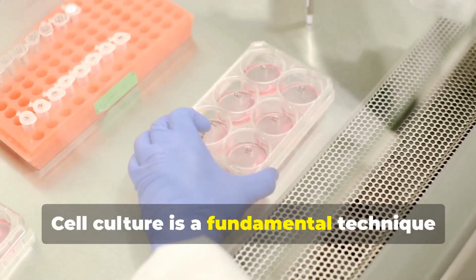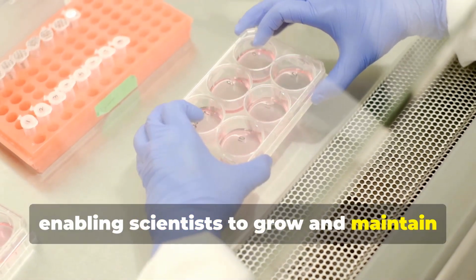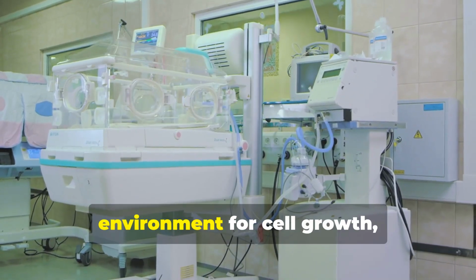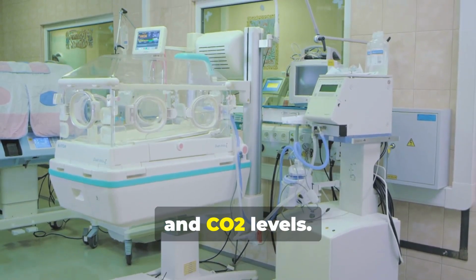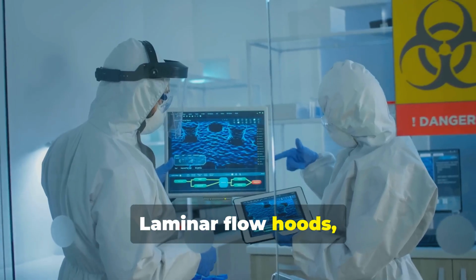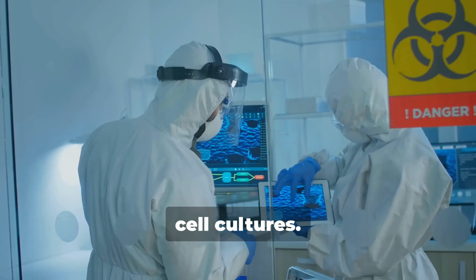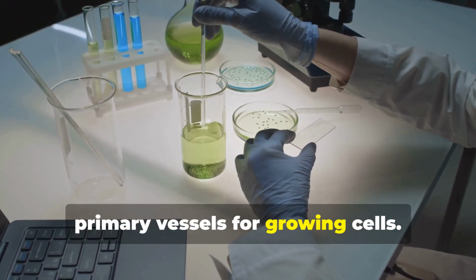Cell culture is a fundamental technique in biological research, enabling scientists to grow and maintain cells outside of their natural environment. Incubators provide a controlled environment for cell growth, maintaining optimal temperature, humidity, and CO2 levels. Laminar flow hoods, also known as biosafety cabinets, create a sterile workspace for handling cell cultures. Petri dishes and culture flasks are the primary vessels for growing cells.